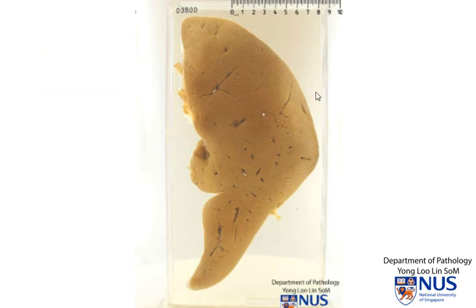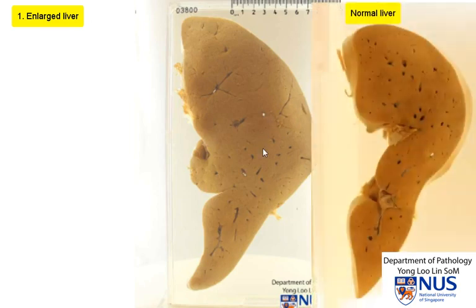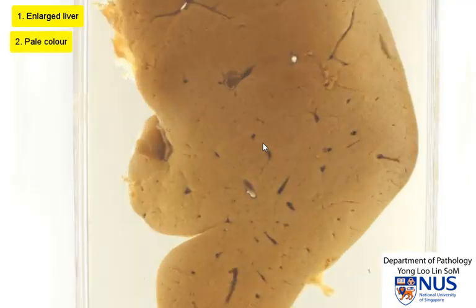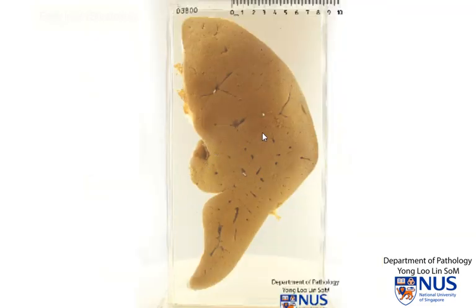There are two things that are abnormal in this liver. First of all, the liver is enlarged. It is quite difficult to really appreciate the size looking at this specimen. However, there is a clue: if you look at the usually sharp points or edges, they're a little bit more blunted here, which gives a hint that the liver is enlarged. The other gross abnormality is the color — the liver is rather pale, and in a fresher specimen it would actually appear a little bit yellowish. So this is an example of fatty liver, fatty change, or steatosis.